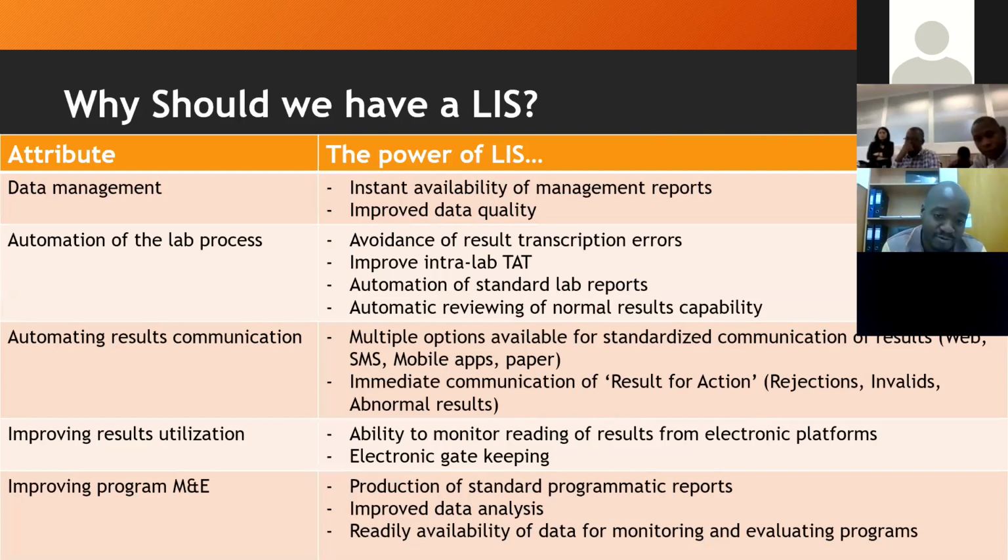The system will flag that you already have a result, so there's no need to order another test. And for the sake of managing programs, from a click of a button, you can set up reports that you can use to manage, monitor and evaluate processes that pertain to the program. Next slide, please.